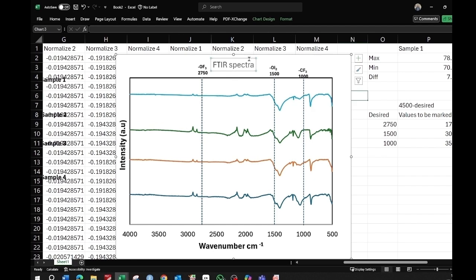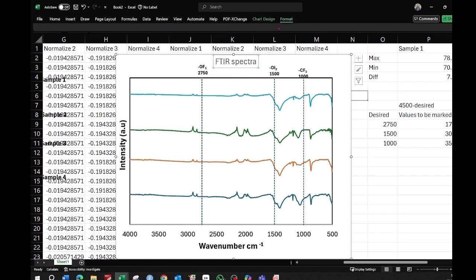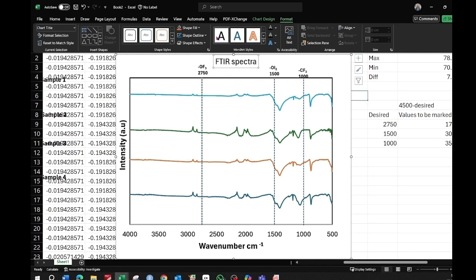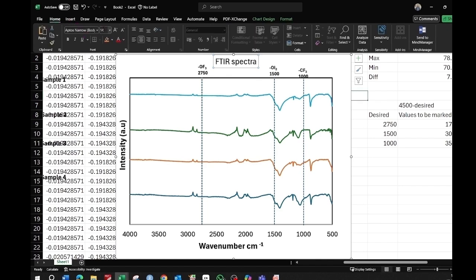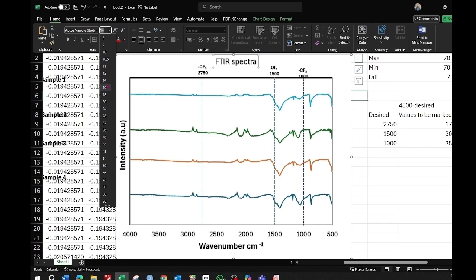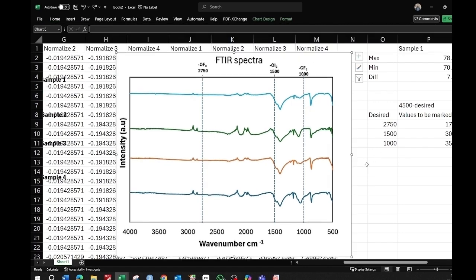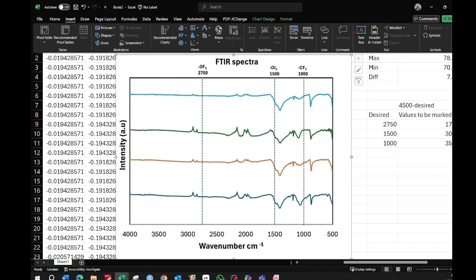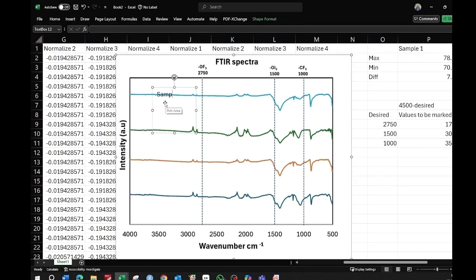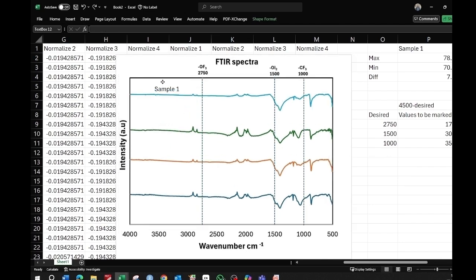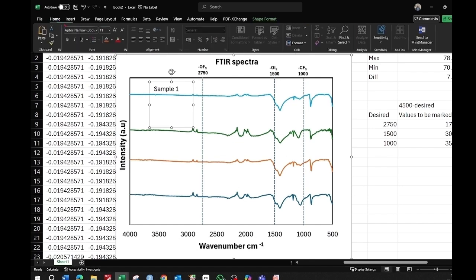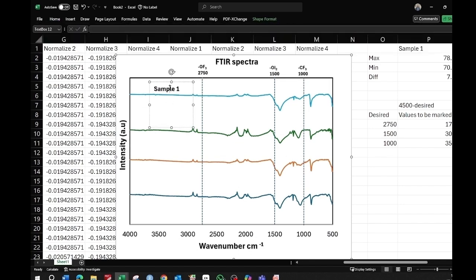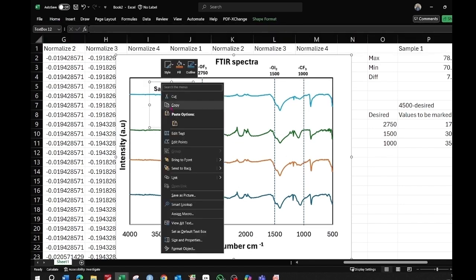Drag the labels to the top of their respective wave numbers. You can also change the chart title and make it bold or increase the size. To add sample names, go to Insert, choose Text Box, and write the sample name — for example 'Sample 1.' Drag it to the top of the corresponding spectral line, then go to Shape Format, make it black and bold.